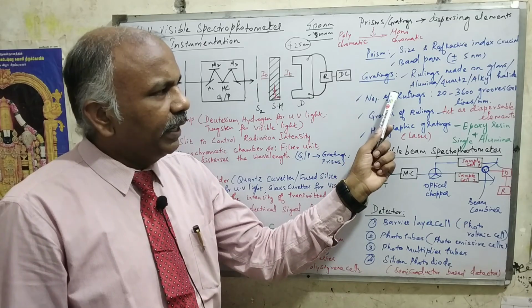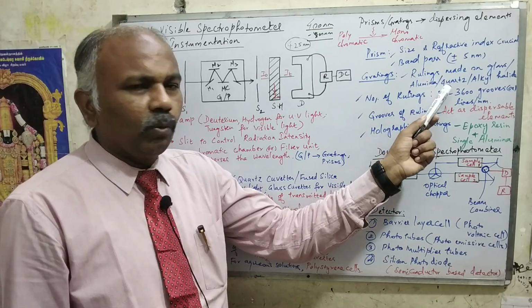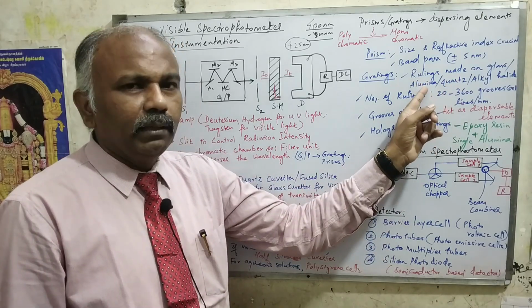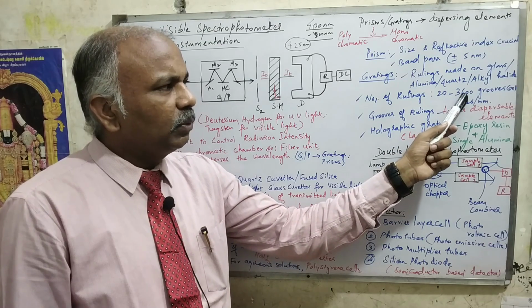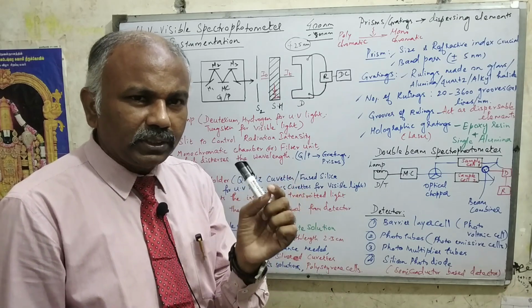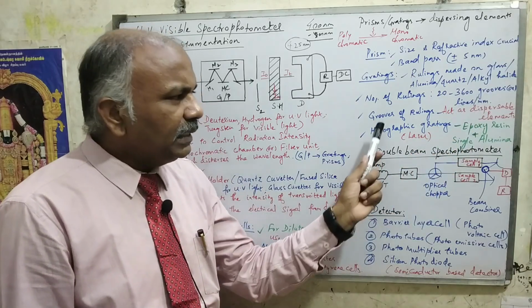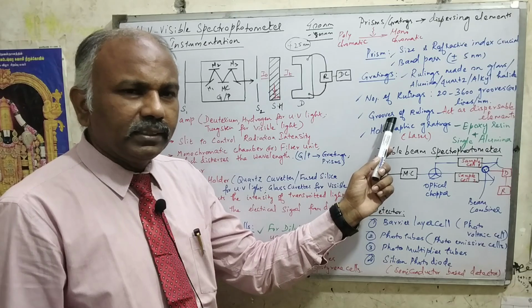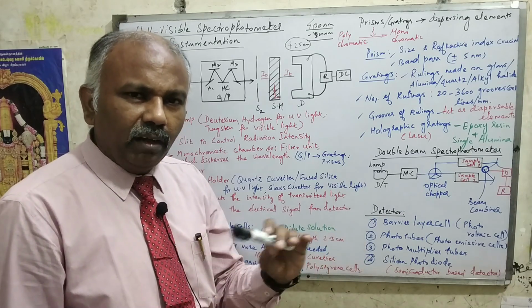Whereas for gratings, what are gratings? Gratings are nothing but rulings made on elements like glass, alumina, quartz or alkyl halides. The number of rulings in the glass will be 20 to 3600 grooves or lines per millimeter. You just imagine. The grooves are very small, minute projections in the glass, around 20 to 3600 grooves or lines per millimeter. These small rulings, the grooves of the rulings, act as the dispersible elements. Particularly, they disperse the radiation of uniform wavelength, right?